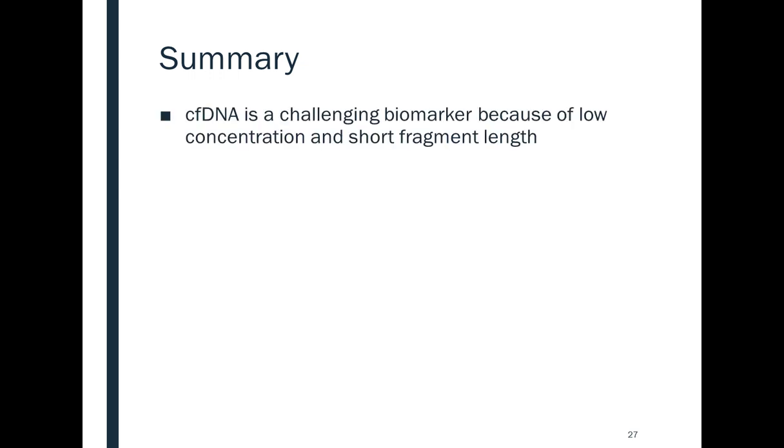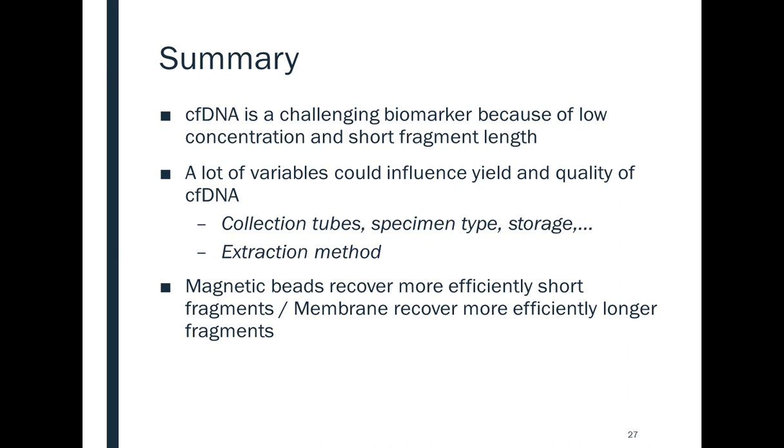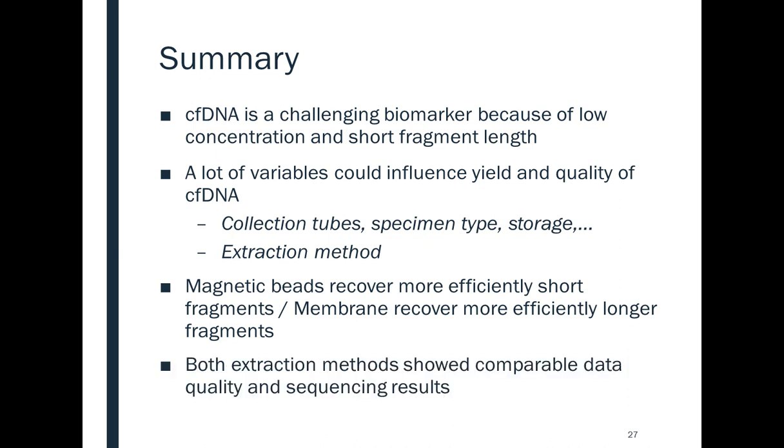To summarize this talk, we could say that cell-free DNA is a challenging biomarker because of low concentration and short fragment length. A lot of variables could influence yield and quality of cell-free DNA. Therefore, it's important to carefully consider all variables during the establishment of a clinical routine. But we could see that magnetic beads recover short fragments more efficiently compared to the membrane-based method. And both extraction methods showed comparable NGS data quality and sequencing results in our lab.